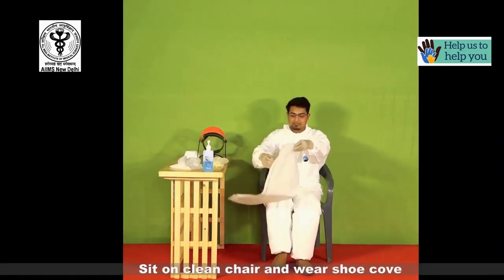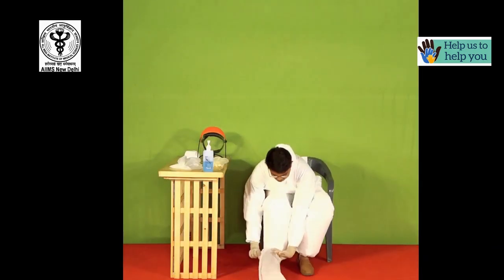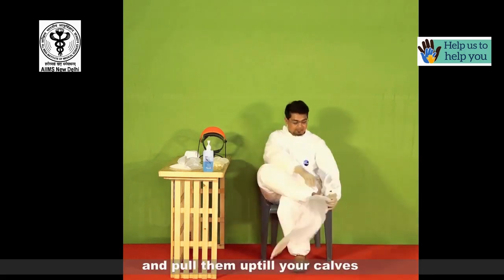Now sit on a clean chair and wear the shoe covers, pulling them up till your calves.